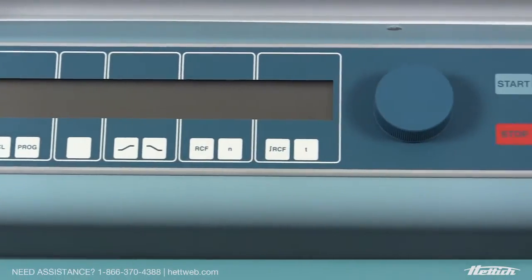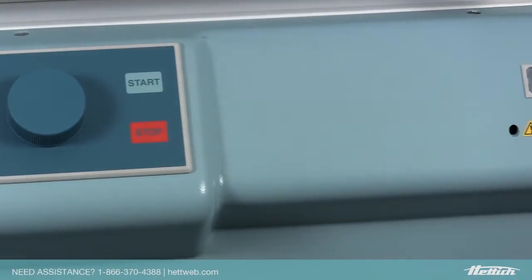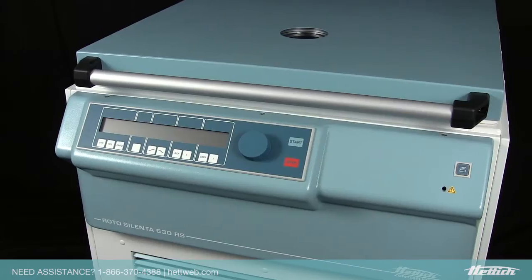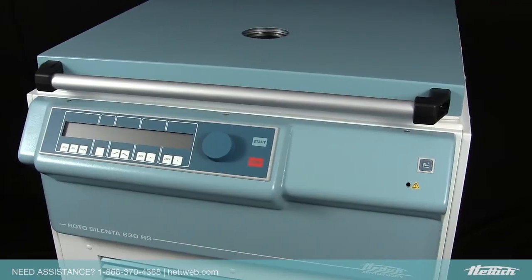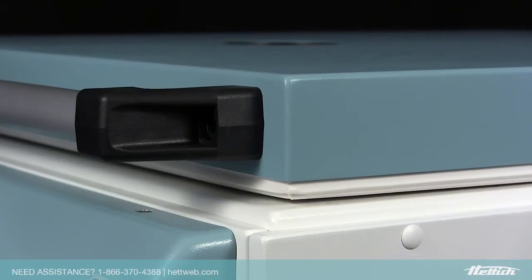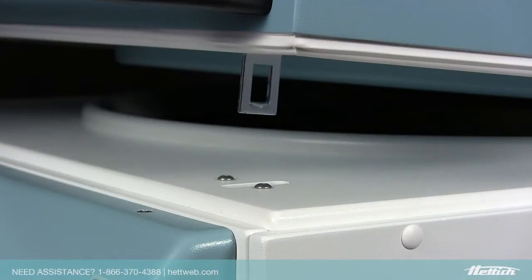The front-facing control panel allows for quick and easy entry of program settings, without the need to reach over the unit to enter parameters. HEDDIC has designed the front-facing easy lift lid, which includes easy push-button opening, eliminating the need for an awkward, cumbersome latch.